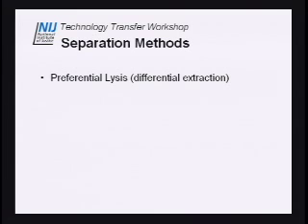Everyone, I'm sure, is using a differential extraction method in their laboratory. It's pretty much the gold standard. Pat will go into more detail on differential extraction if you don't remember, so I won't go through it. But some of the other separation methods out there include flow cytometry. It does an okay job of separating, but unfortunately you need a lot of sample.